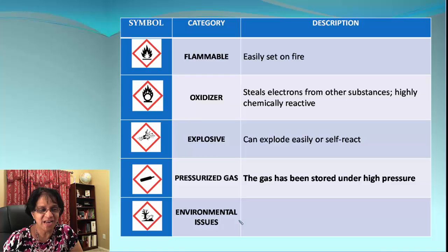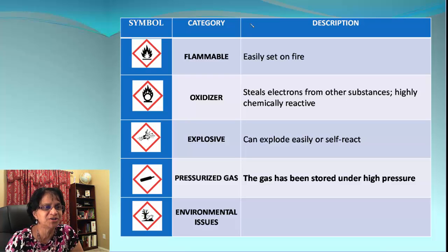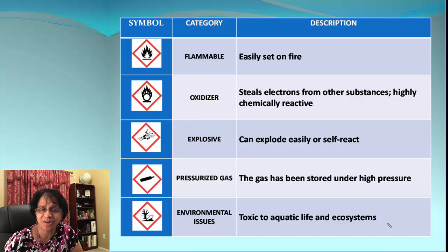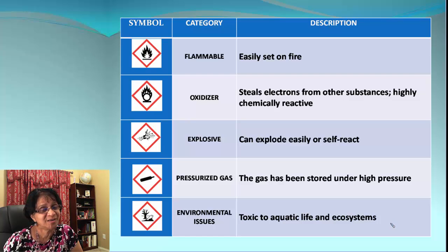Next is environmental hazard. Look at the symbol — it shows a tree and a fish. A chemical substance could be toxic to aquatic life or dangerous to any ecosystem. We have to be careful about how to dispose of such chemicals.